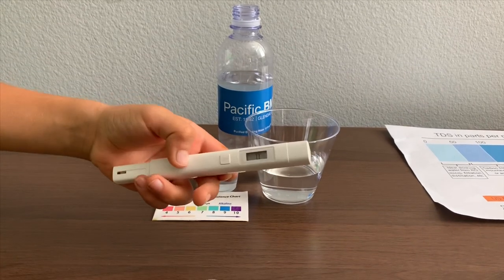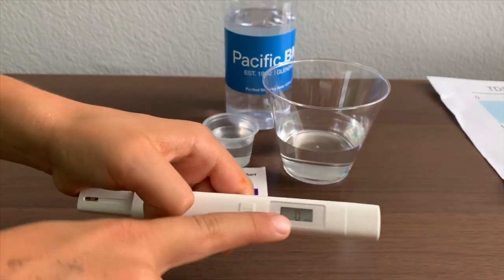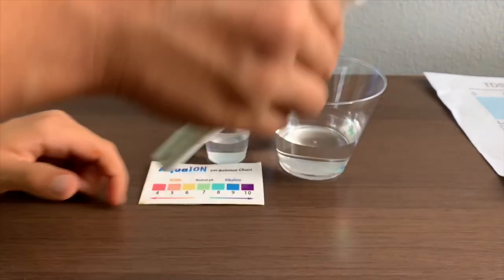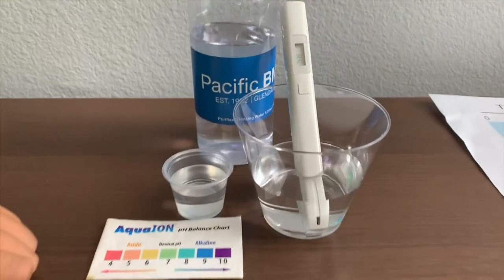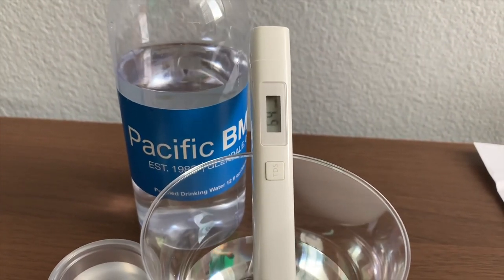If you want to buy this TDS Tester, check the link down below. Turn on the TDS Tester, make sure it says zero, and put it in.